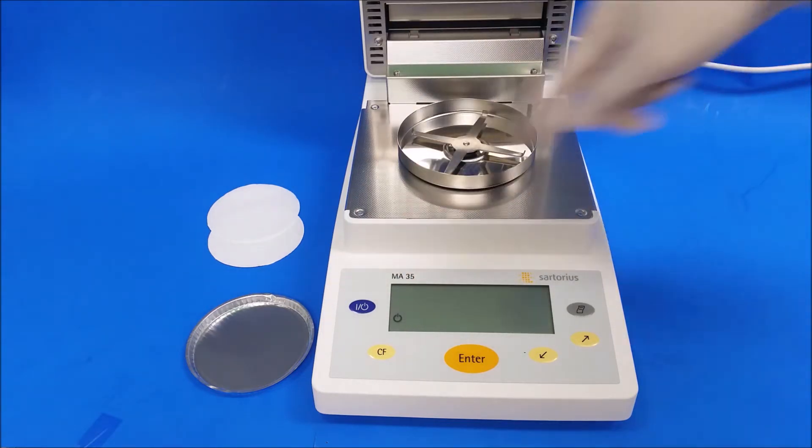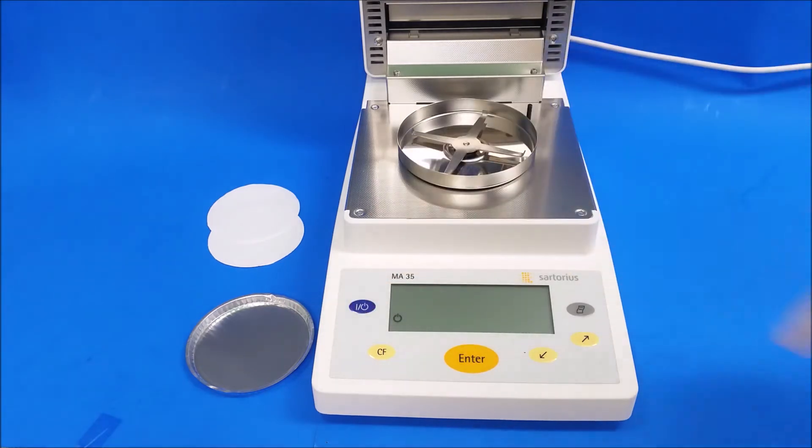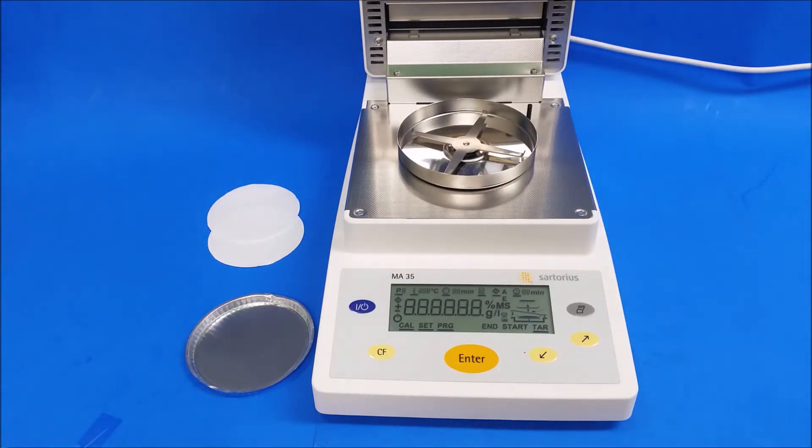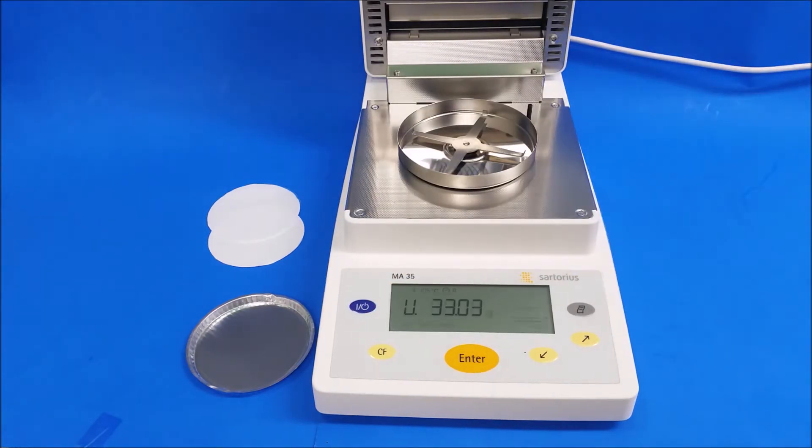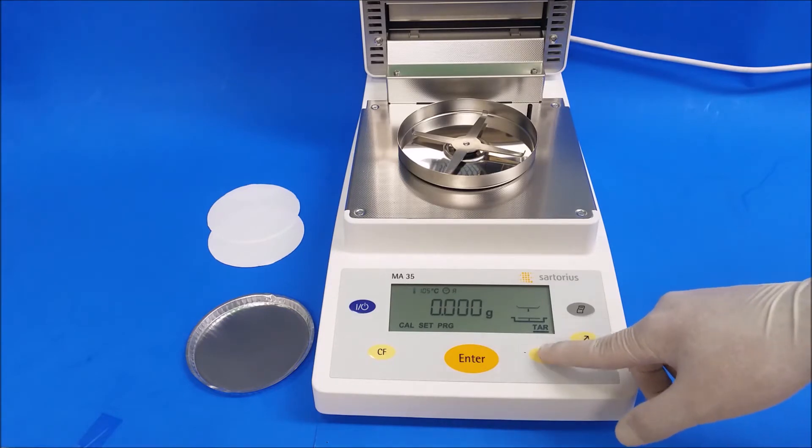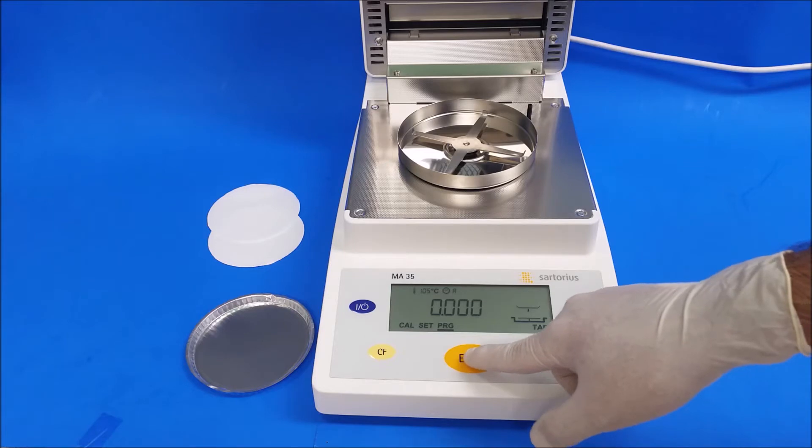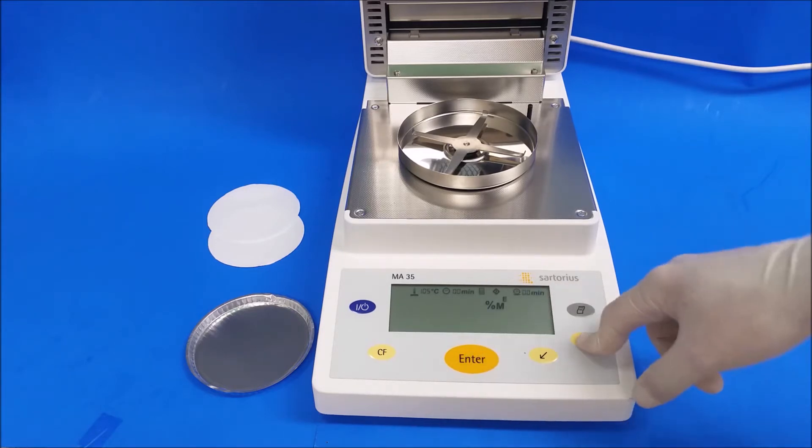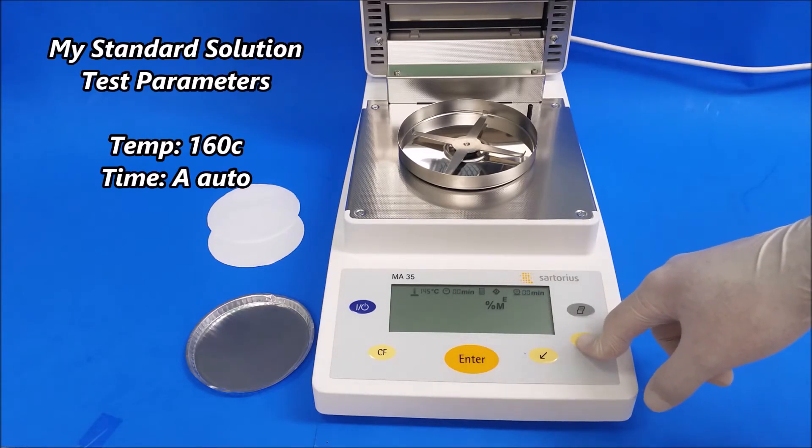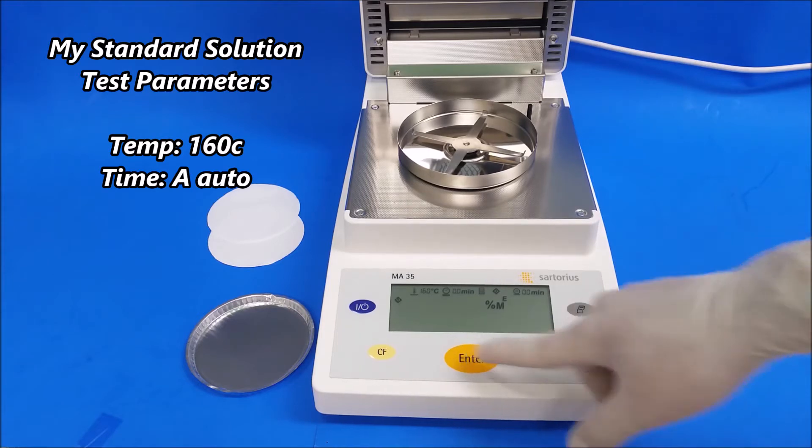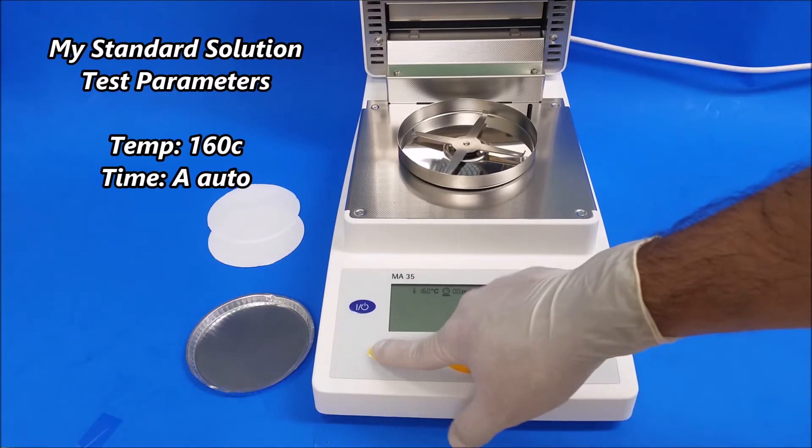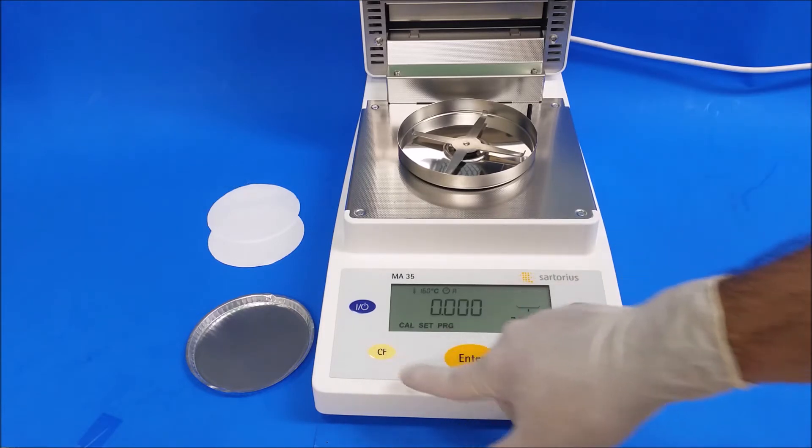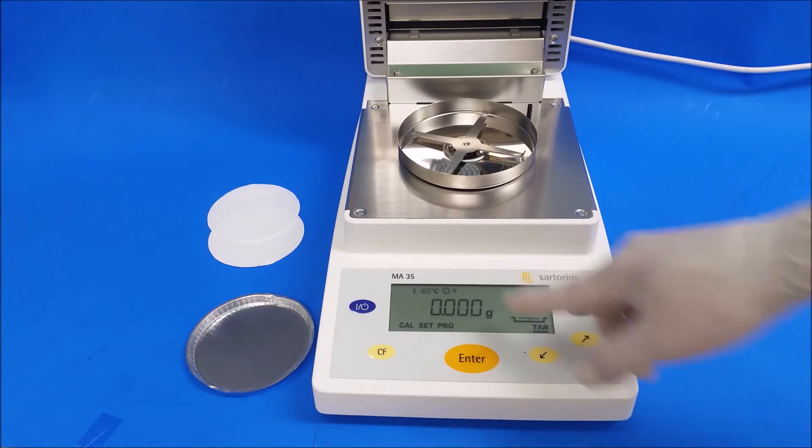You go to program, then enter. I already have it at 160 and it's already on auto. You've got to make sure when you're going to tare, you have to be underlining tare.